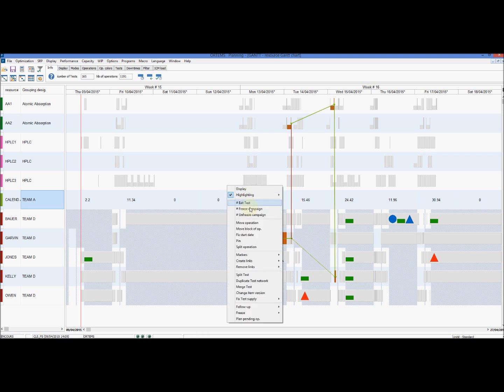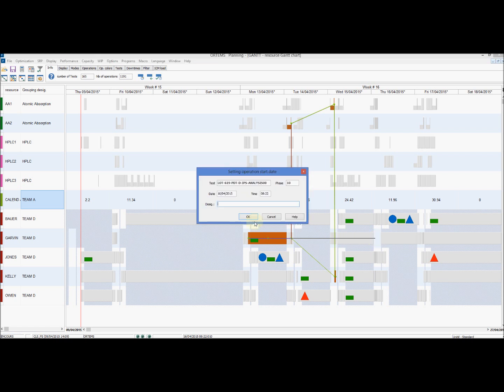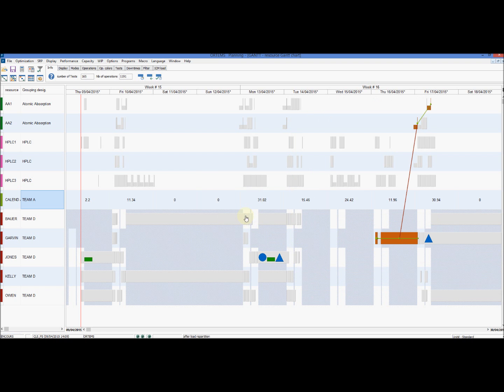It is important to understand that in Ortems, all the different steps of the operation are synchronized in one loop, meaning that if I push forward the first step of the operation testing, I will be pushing forward all the different operations forward.